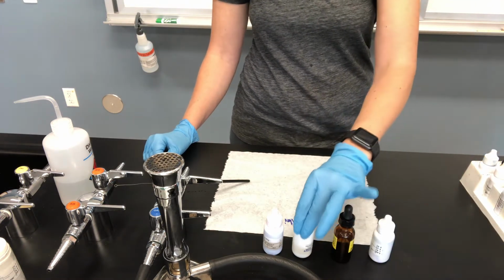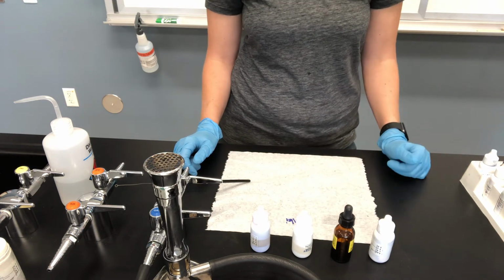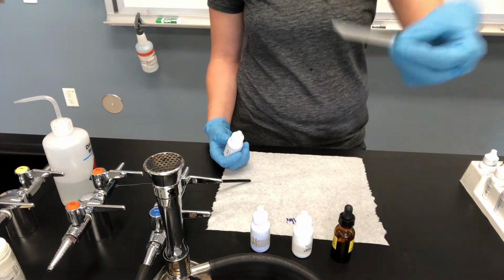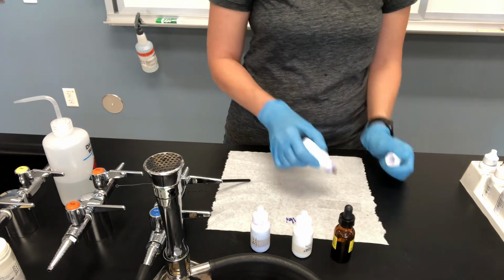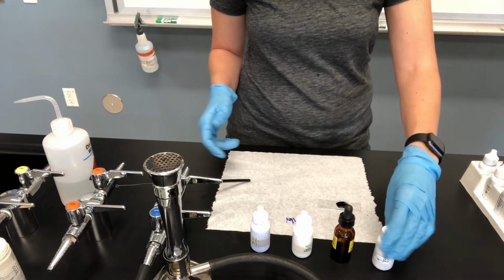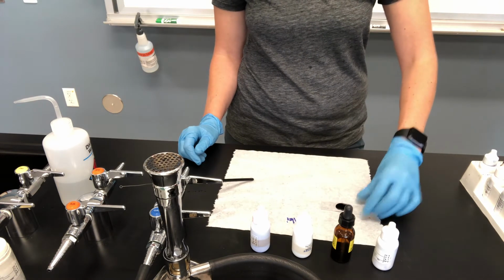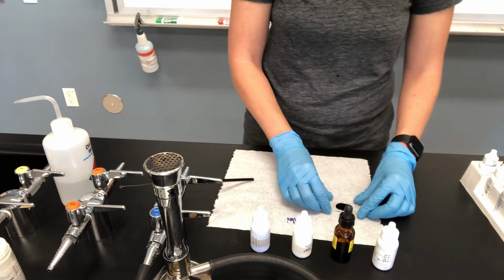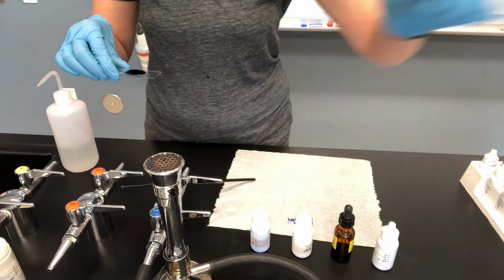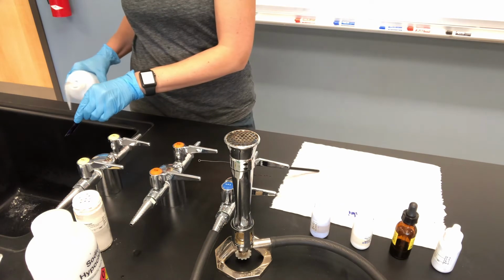I put them in order so I know exactly which one I'm going to do, because we don't want to mix things up and take them from the wrong spot on the tray, because sometimes that happens. So I know I'm doing crystal violet first. I'm going to do that, flooding my smear for 60 seconds. This is a nice, cool purple one that's got some iridescence in it, which is kind of fun. Sometimes it looks like it's got some gold in there. For purposes of time, I'm not going to sit here for the full 60 seconds, but you will on yours. So we're just going to pretend 60 seconds went by. I'll turn towards the sink so you can see that a little bit better. Okay, so then you'll just spray that off right into the sink.